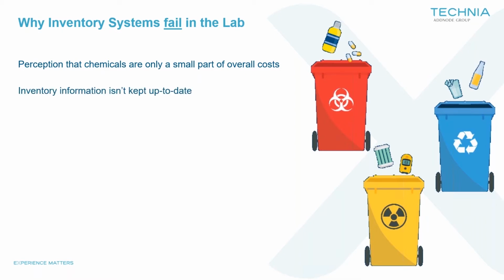A common problem many labs stumble over is how to keep track of bulk chemicals, equipment, and solvents. Knowing who has taken an item, what condition the item is upon return, and whether it needs to be reordered are just a few of the questions that need to be addressed to ensure accuracy.